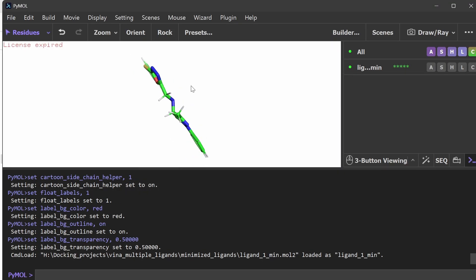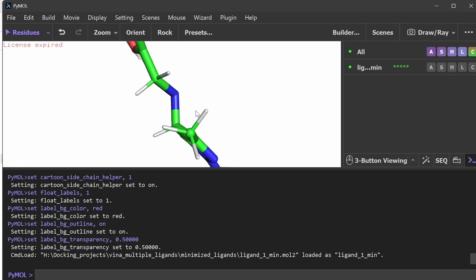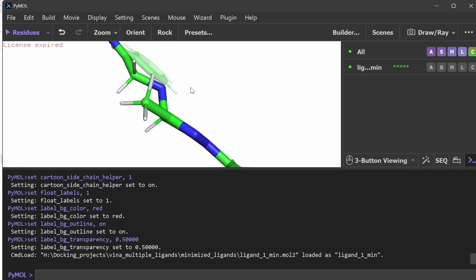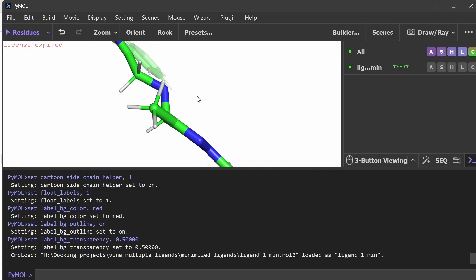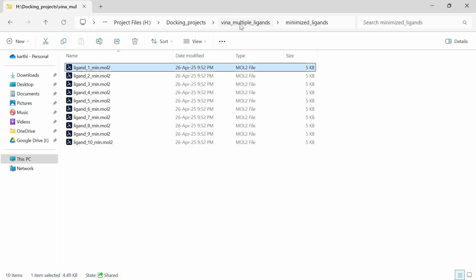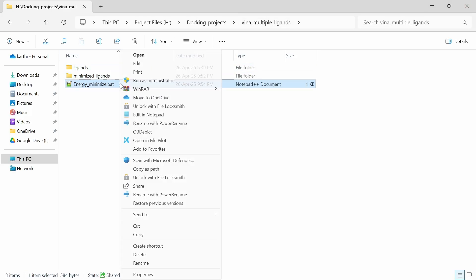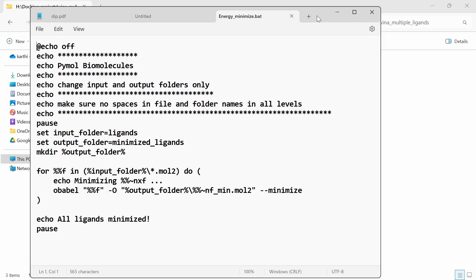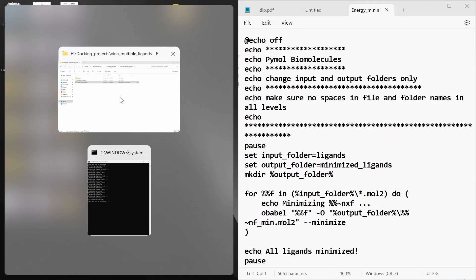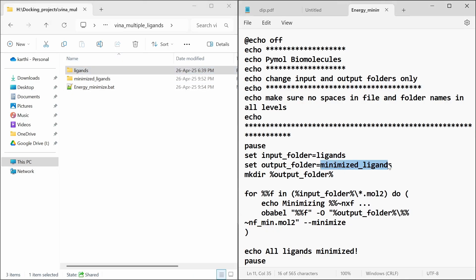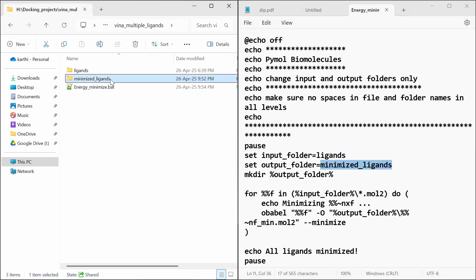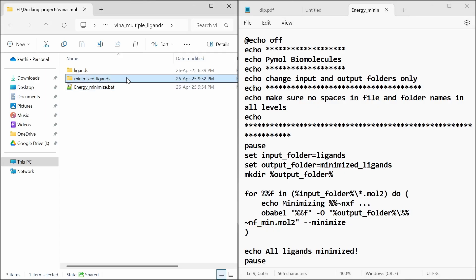You can see most of the bonds are flat and the hydrogens are energy minimized — all the atoms are minimized. Now I am going to show you how to minimize ligands easily using this batch file. Here you have to change the input folder and the output folder. The input folder is 'ligands' and the output folder is 'minimized_ligands'. If the output folder is not available, it will be created.